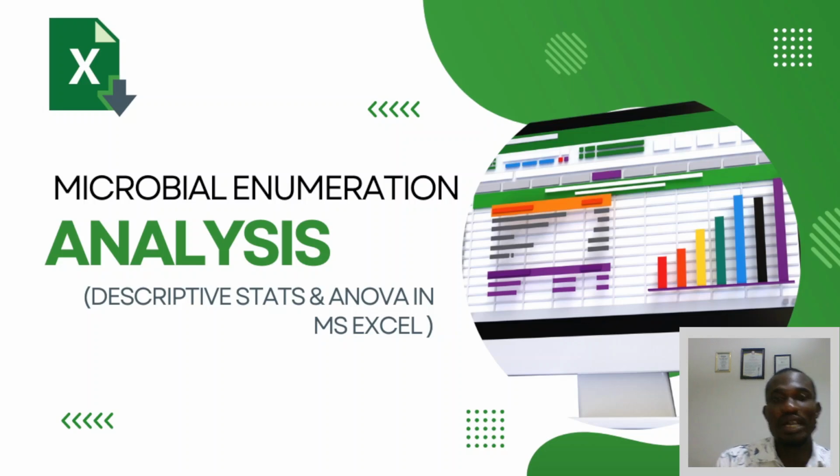So if you have different batches of a product, you can use ANOVA to determine if there is a difference between batch 1, batch 2, and batch 3 based on statistics. We can look at data ourselves and tell that this looks higher than that, but in statistical terms, is there any difference? That is what ANOVA is going to help us identify based on your confidence level and things like that. So you're going to get a p-value or a significant value from that analysis.